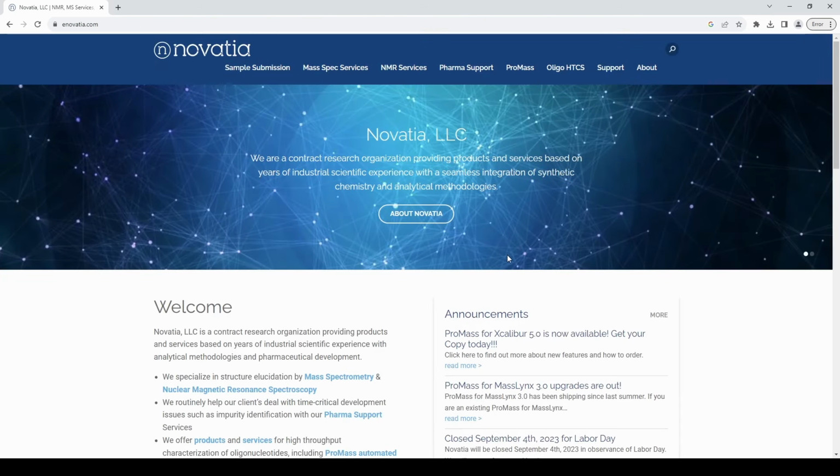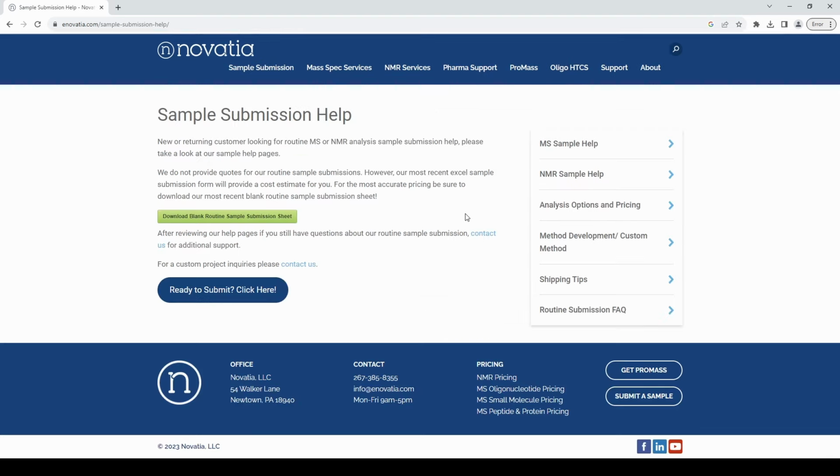Once you're on our website, we're going to go ahead and click on Sample Submission. It redirected us to our Sample Submission help. There's some useful information here before submitting a sample if you would like to read that. Once you are ready to submit and you've read through this, let's go ahead and click on this.